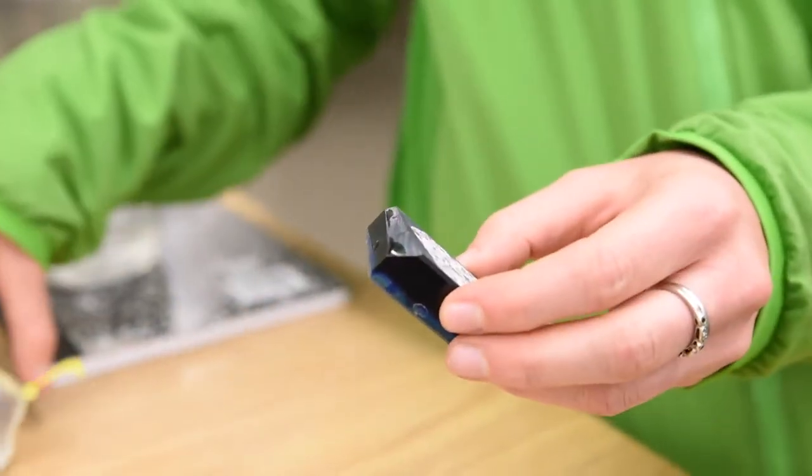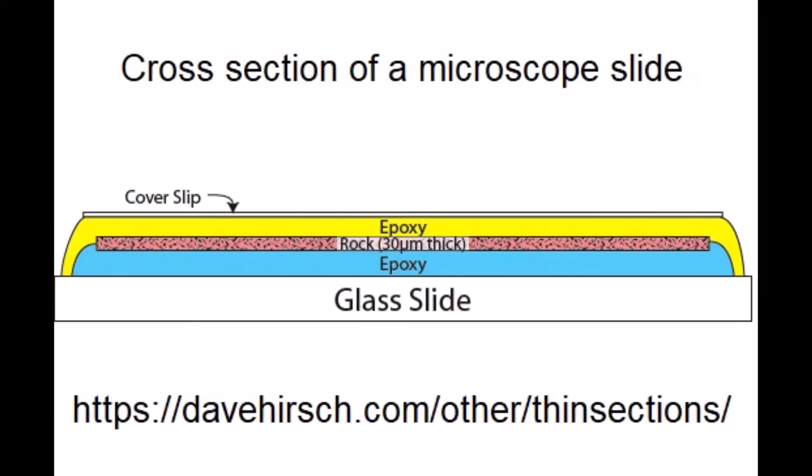After the billets are glued to the slide, they are trimmed and ground down to 0.03 mm, or 30 microns. This is the standard thickness for a thin section. If we alter the thickness of our sample, it changes the way microscope light interacts with the minerals.